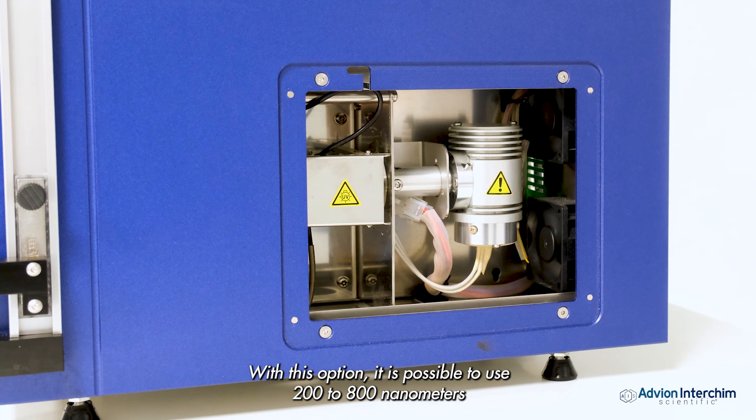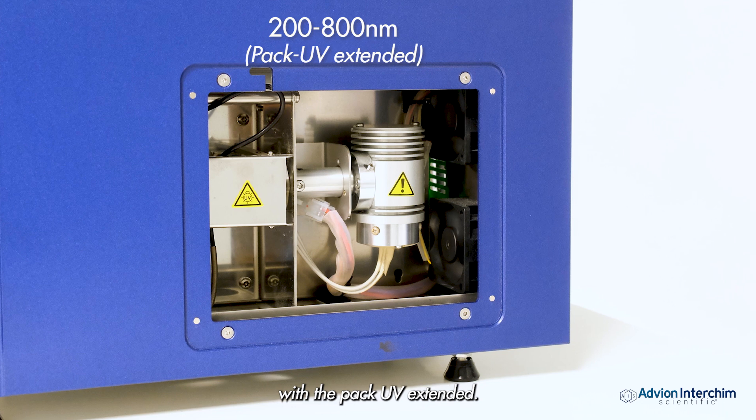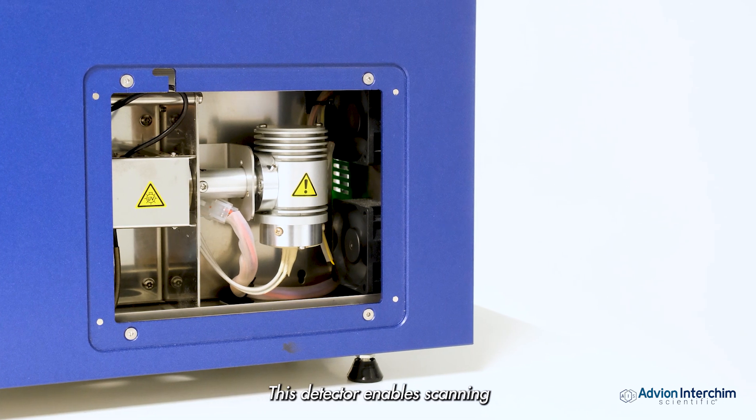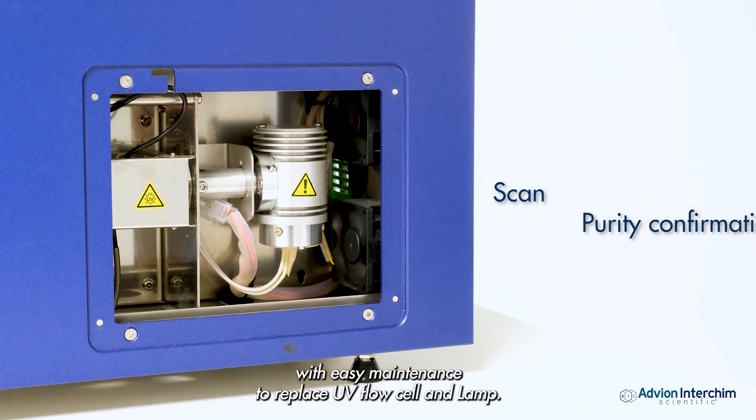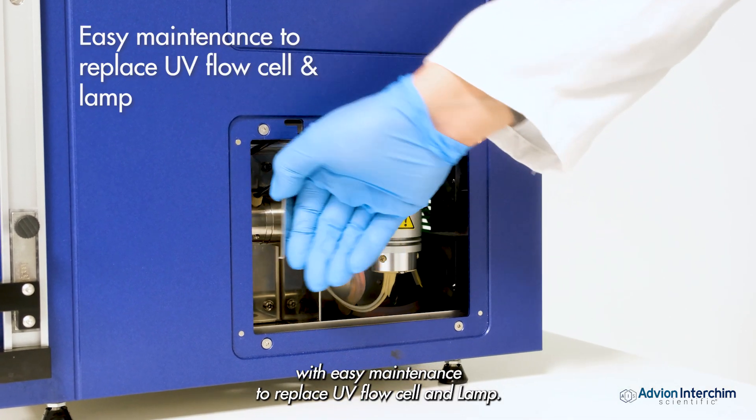With this option, it is possible to use 200 to 800 nanometers with the UV extended pack. This detector enables scanning to obtain purity confirmation with easy maintenance to replace the UV flow cell and lamp.